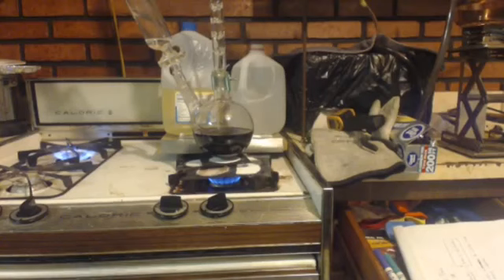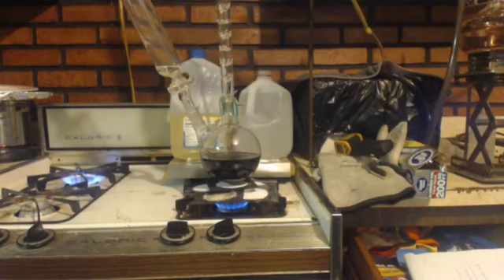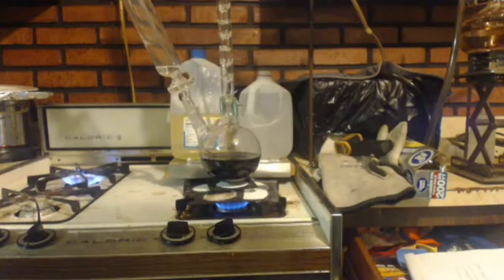Now, when I made my Grignard reagent, I didn't put any diethyl ether in the magnesium, which was a big mistake, because it acts as a heat sink. You should put it in there. But I didn't have enough, and so I was a cheapskate about it. Same thing with this reaction. I didn't use as much diethyl ether as I should have, so there should be more in there, right? If there was more in there, I don't think that salt, that tetrahedral intermediate, which is, say, an alkoxide, would be precipitating out like that. I think it would be dissolved in the ether. I think that's the way you're supposed to do it, although I'm not sure. But I don't think that would be happening if I had put as much diethyl ether in as I should have.